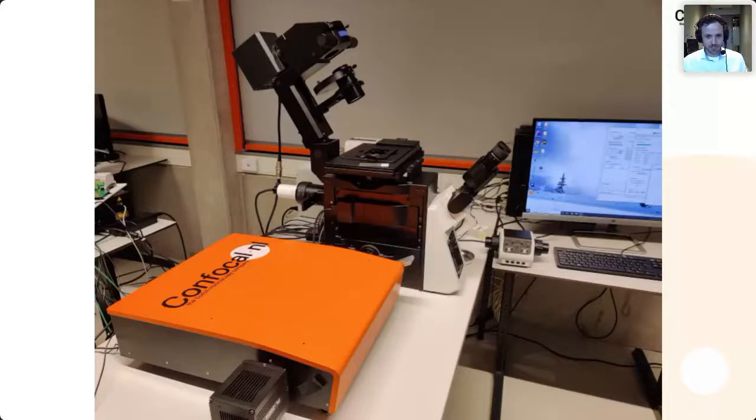I just included this slide to give you a brief summary of what I will be using during the demo. Here is an Olympus IX83 frame. In the back, you cannot see it in this picture, there's a cool LED wide field illumination unit.